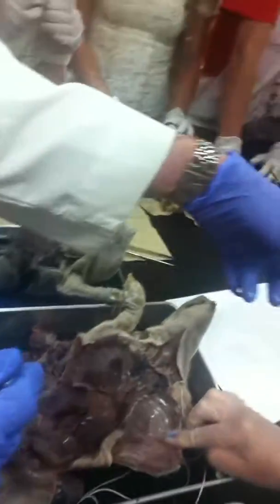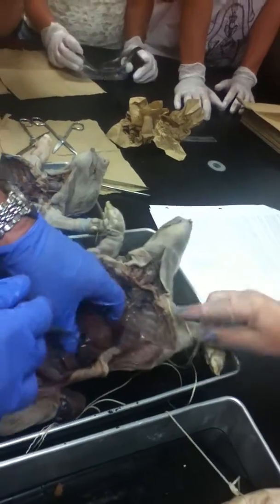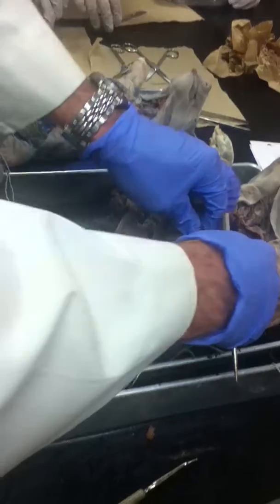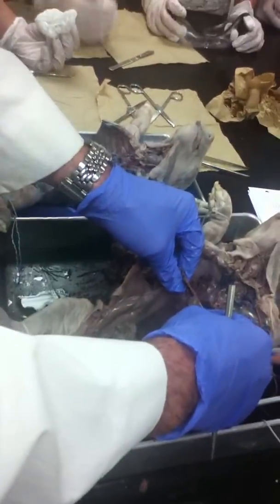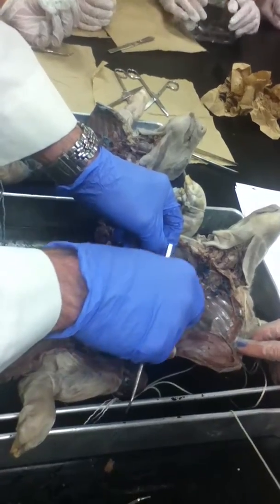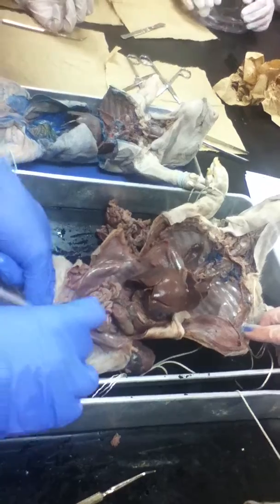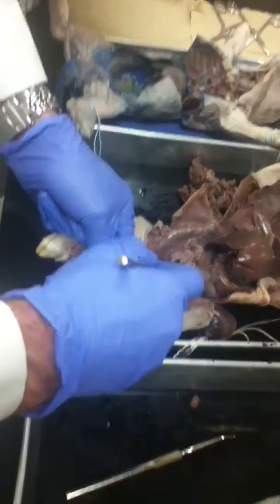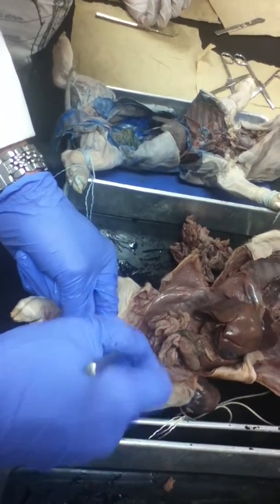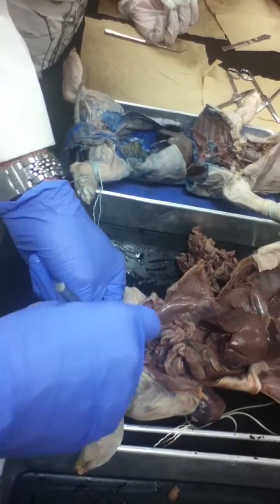Now, you turn a page there. You're good holding that now. You can change it. Now, with the abdomen and all of this stuff down here, okay, we already went over the diaphragm. This is the diaphragm here, this tissue. This big thing here, that's the liver, and you have the lobes of the liver. The umbilical arteries, these two here, that one, okay, that one, and there's one there. That's your umbilical arteries, okay.